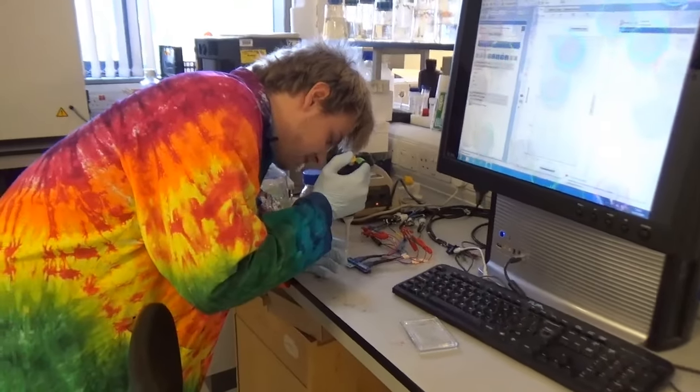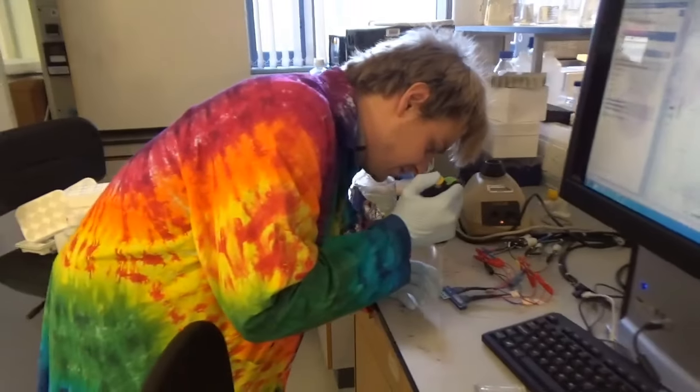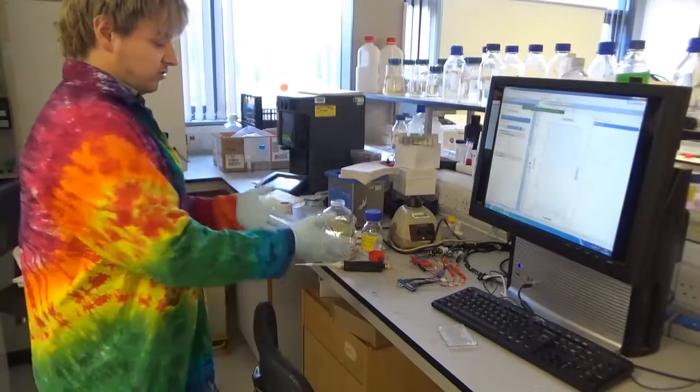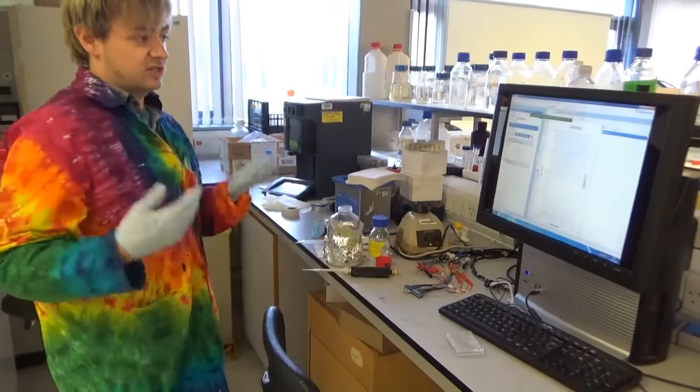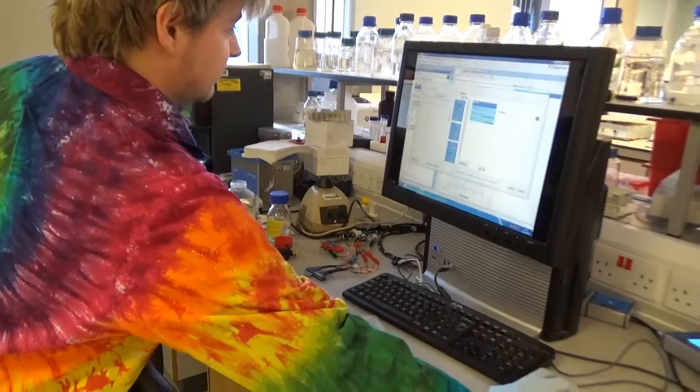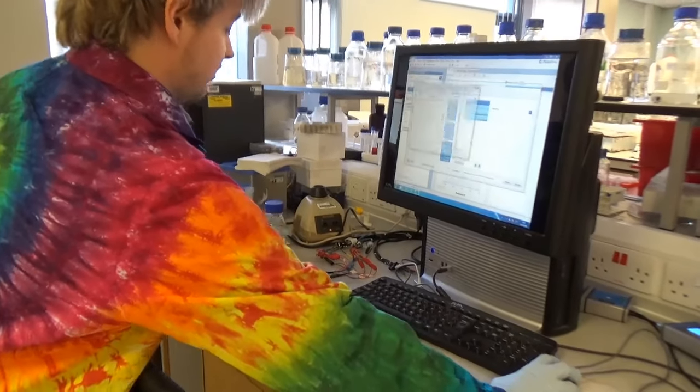I am a chemist, so I would say that. And I basically just apply that to the electrode. Basically what I do is I apply a voltage to those electrodes, and then that voltage generates a current. The more current that I get, the more microRNA are on the surface.